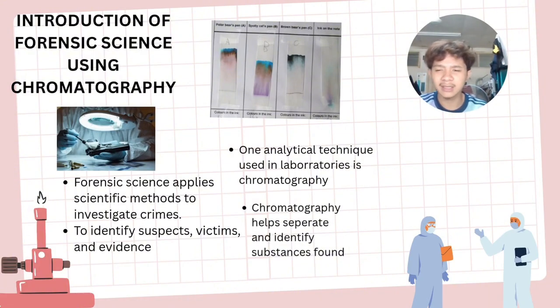This technique allows scientists to separate and identify the different components of a mixture, making it easier for scientists to determine what substances are present. Chromatography plays a significant role in providing accurate scientific evidence that can support criminal investigations and court cases.